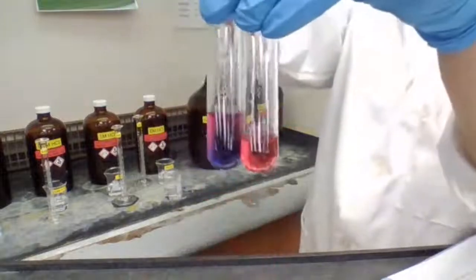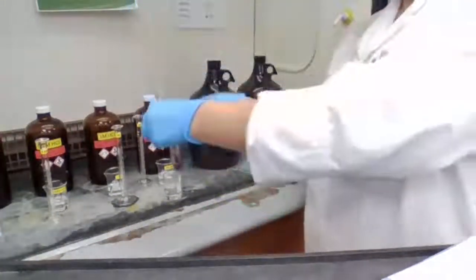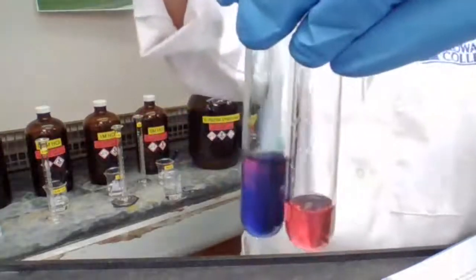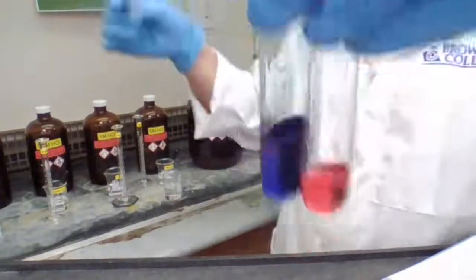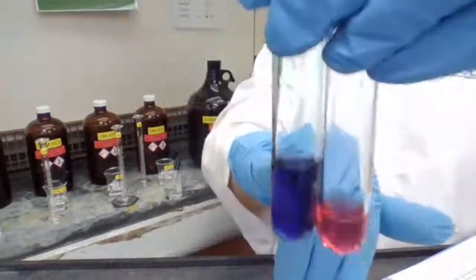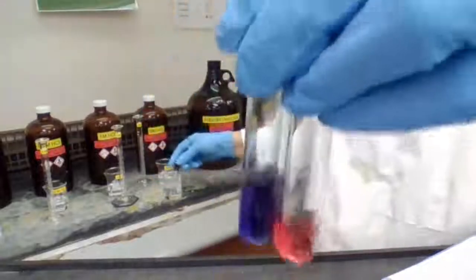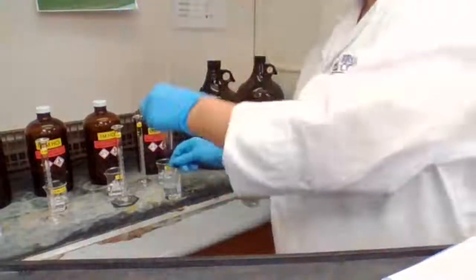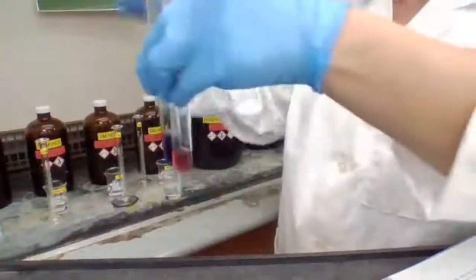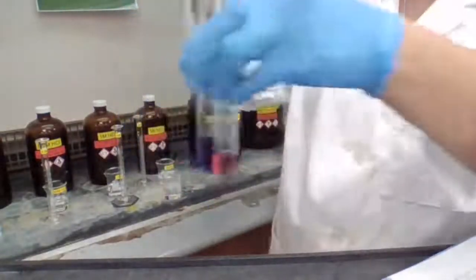So it's a good comparison to see what color changes take place by adding HCl, because I only added it to one of the test tubes. There is a color change there. I want you to record what is happening after adding HCl, and I'm going to add HCl to the other test tube as well. Adding concentrated HCl.